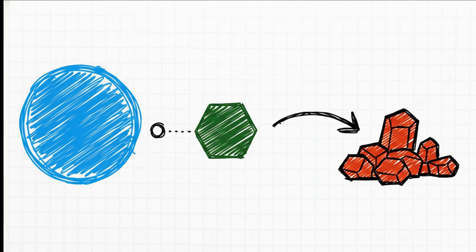And the brilliant part of this is the visual payoff. See, while copper-2 in solution is this beautiful deep blue, the very second it accepts that electron, it physically transforms into copper-1 oxide, which forms a heavy brick-red precipitate. So this microscopic electron exchange literally paints the invisible sugar red.